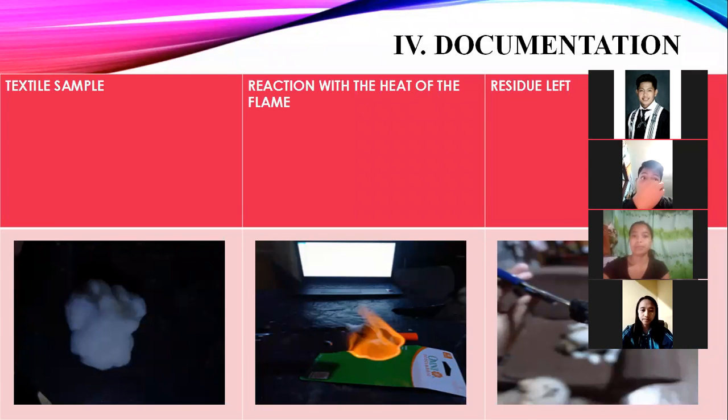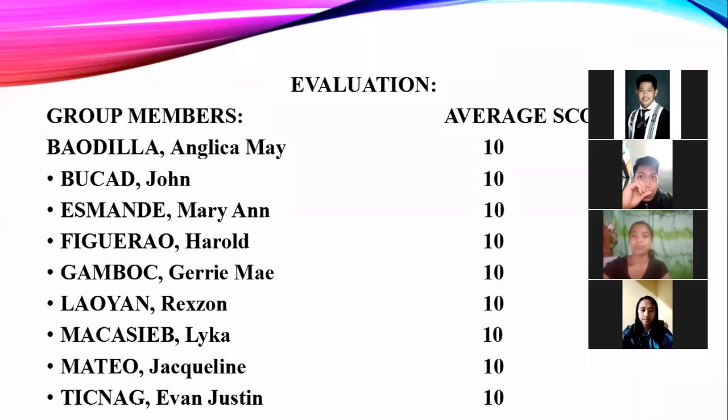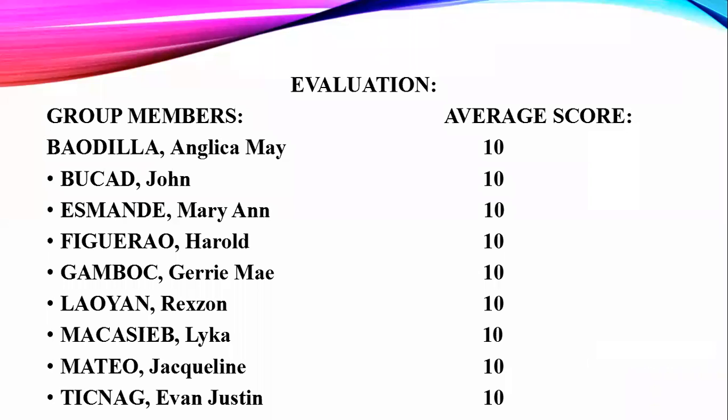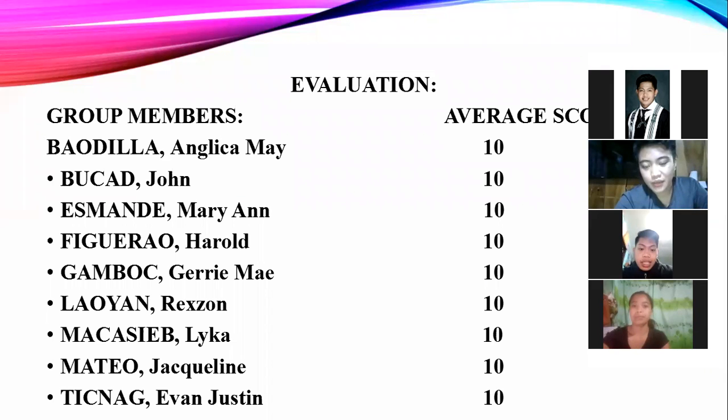These are the documentation of our experiment, which is the textile sample reaction with the heat of the flame and the residue left. And lastly, that's what we were reporting in our experiment regarding textile fiber.